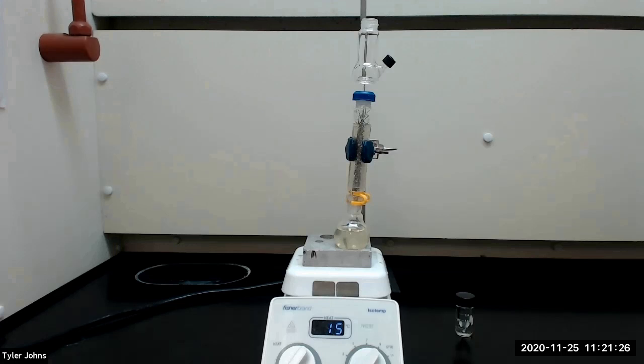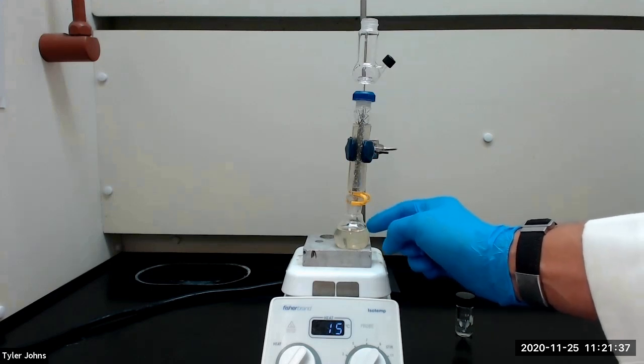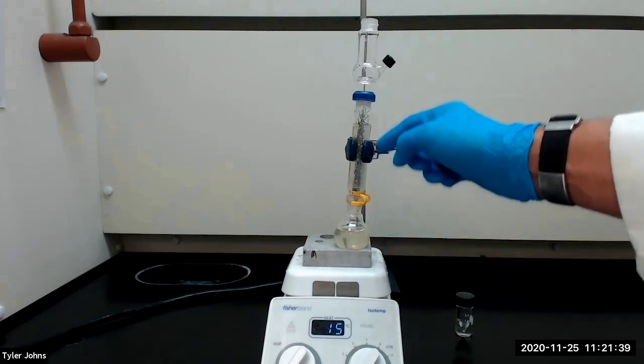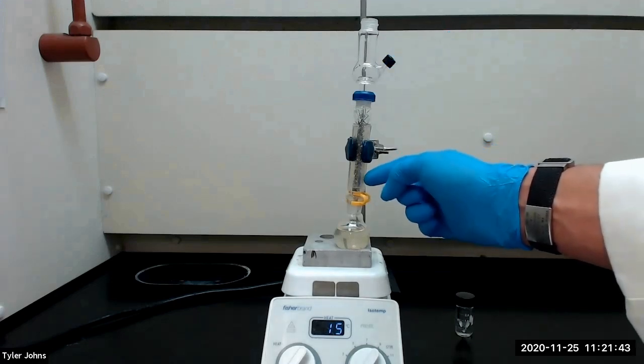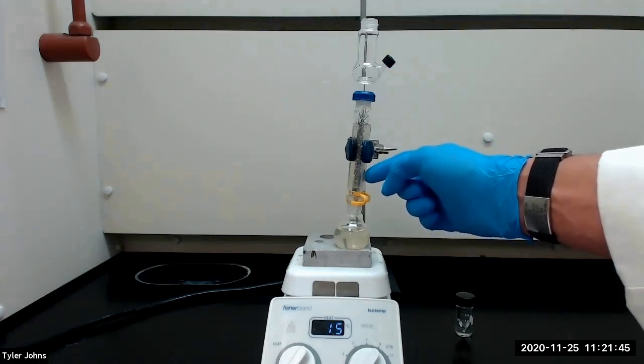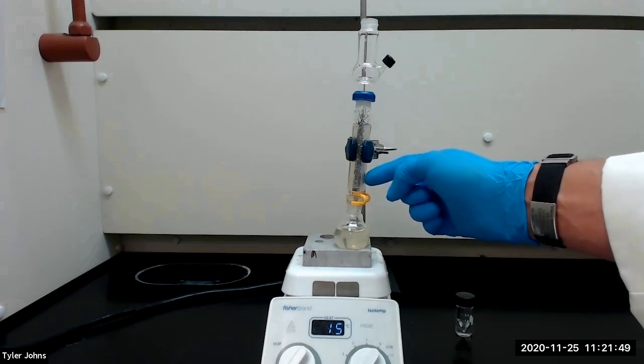We will next perform a fractional distillation of the fermented liquid. The fractional distillation apparatus consists of a 25 milliliter round bottom flask with the fermented liquid and a boiling stone, connected to a fractionating column and a Hickman head still. The fractionating column has been packed with approximately one gram of stainless steel sponge and insulated with two layers of Tigon tubing.